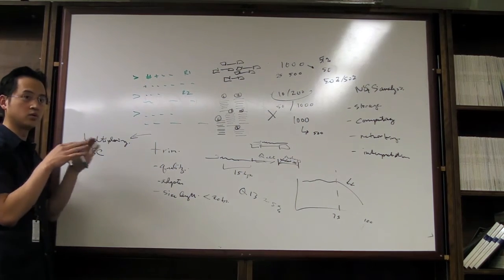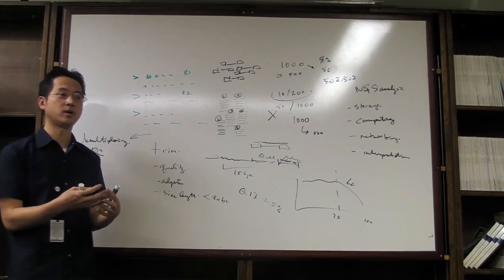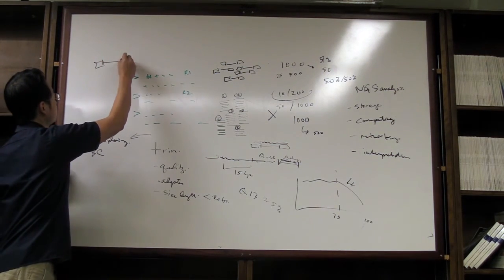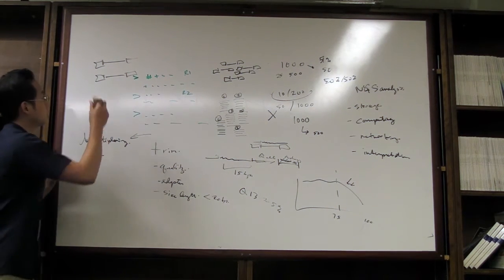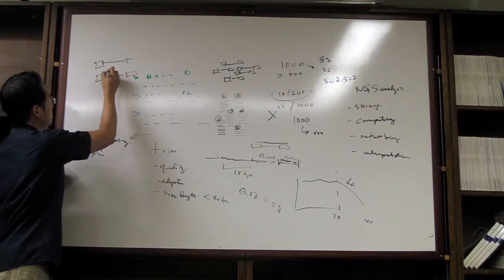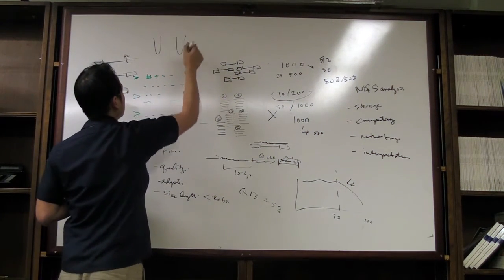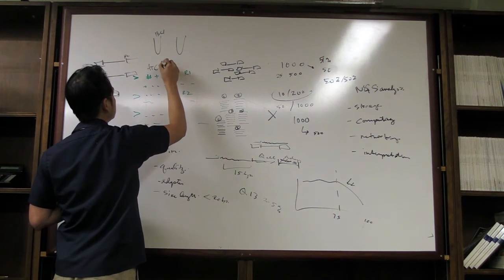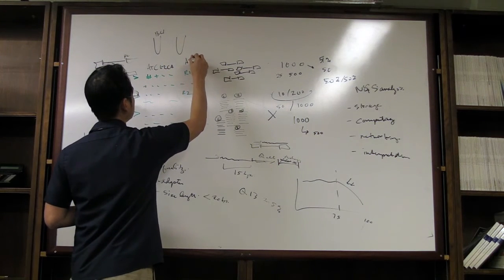So when you run sequencing, in order to get more out of your run, let's say you want to do 50 patients in one run, the way to do it is during library construction, you're going to use adapters that have a certain barcode. So let's say the barcode is built into here, barcode is built into here. So for patient 1, you want to use barcode number 1, and barcode number 1 could be ATCGCCA, something like that. Barcode number 2 could be ATGCCGA.